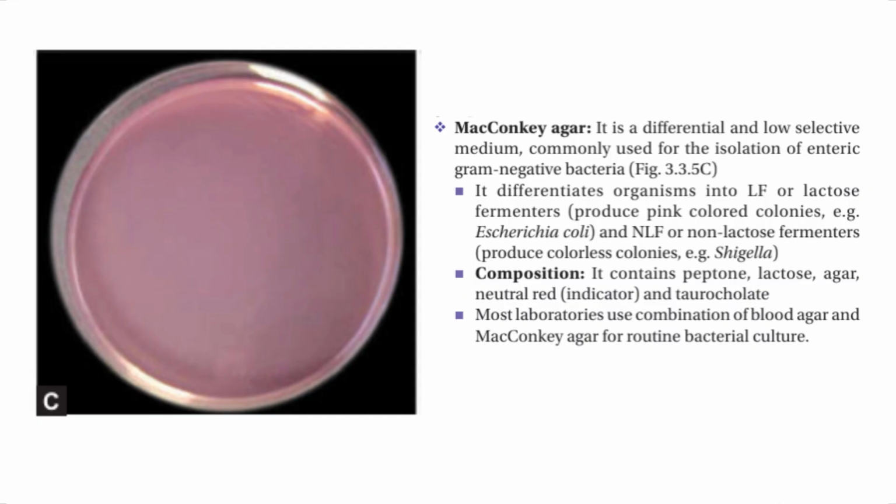We call these LFs, or lactose fermenters. But if they don't ferment lactose, like Shigella, they just grow as these pale, colorless colonies, known as NLFs.